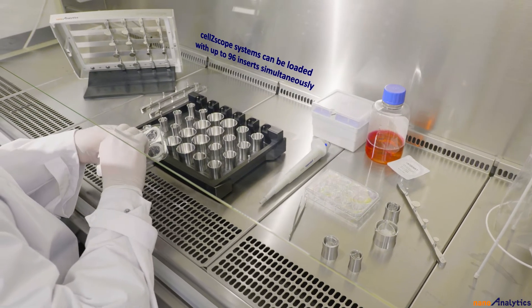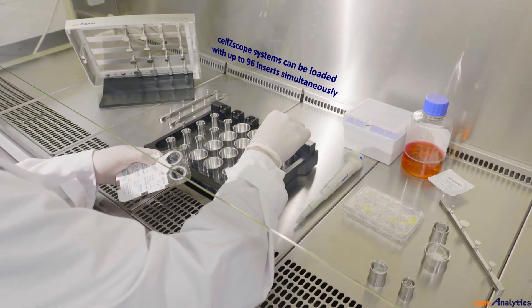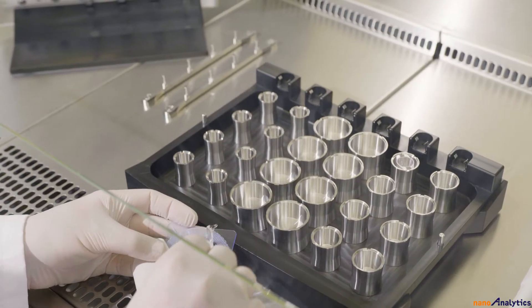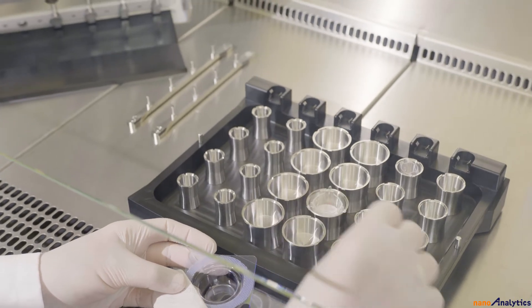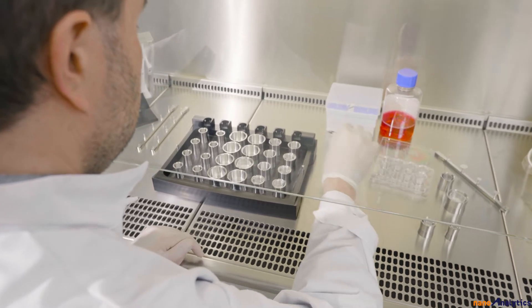Depending on the model, CellScope systems can be loaded with up to 96 inserts simultaneously. With its innovative and user-friendly design, the CellScope offers full compatibility with standard cell culture inserts from all major manufacturers.